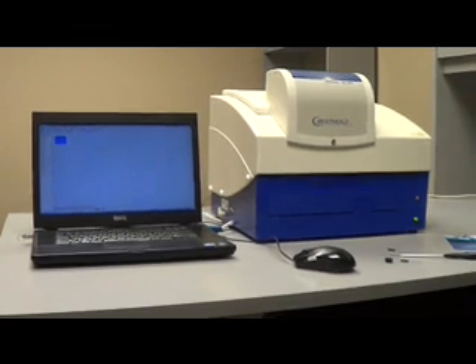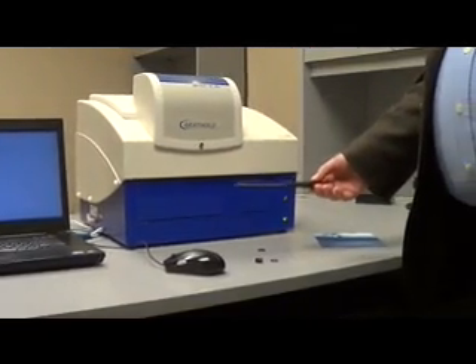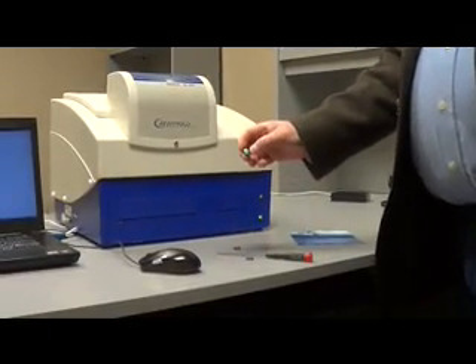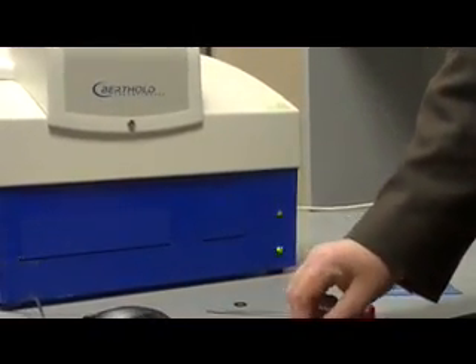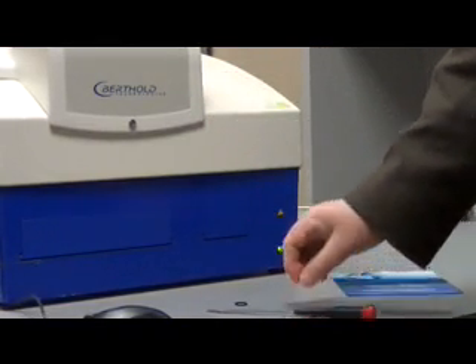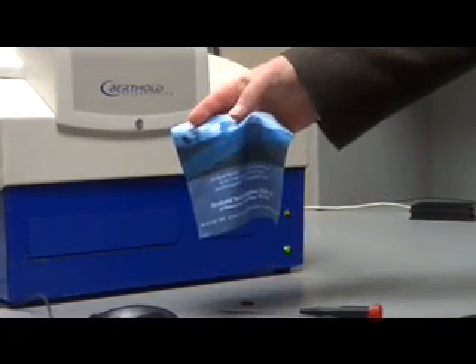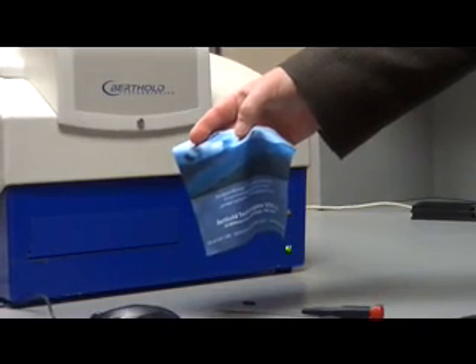First thing you're going to need is some tools: a small screwdriver, the filter — in this case a 485 nanometer filter — and a clamping ring. It would also be nice to have an optical cloth so in case you get any fingerprints on the filter you can wipe them off.